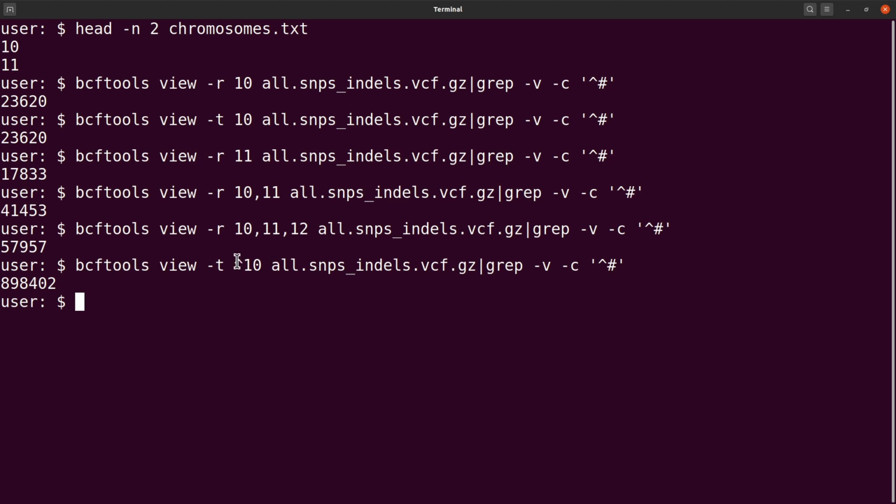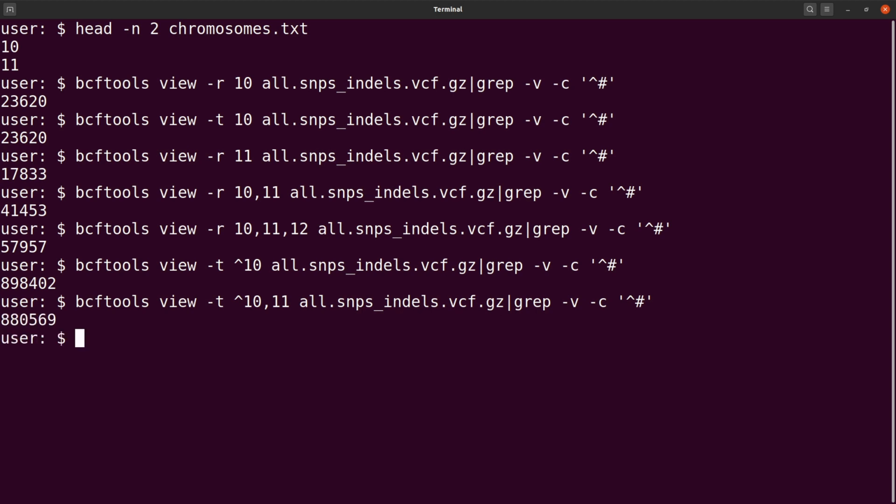You can still do it. Let's say we want to exclude 2. You can just bring the comma here and add the other one as well, and that will also give you the counts. Okay, so that's how we do it.